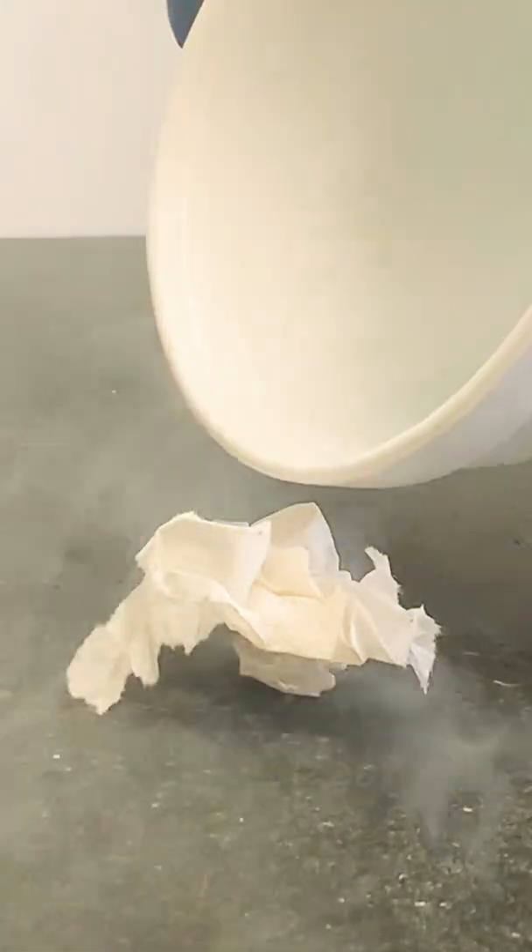Things burn better when they're exposed to oxygen. Let's see how this paper towel burns when it's exposed to liquid oxygen. I'd say that worked pretty well.